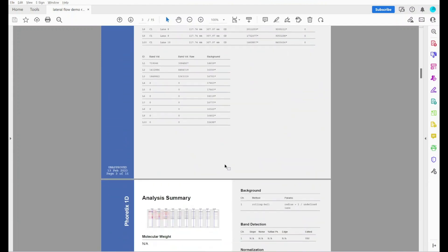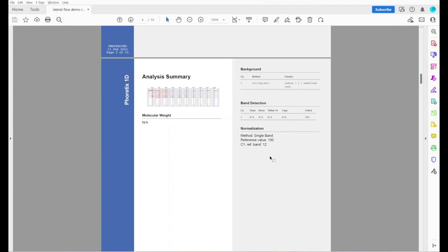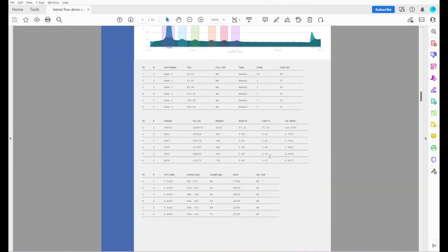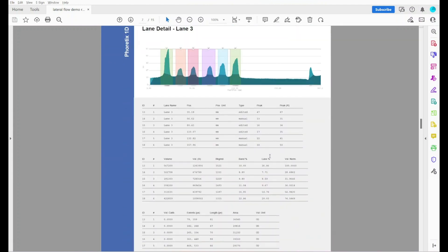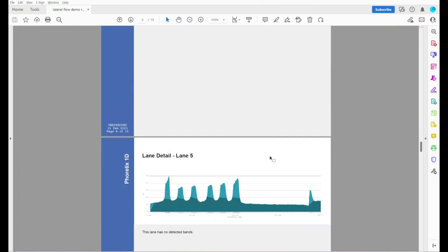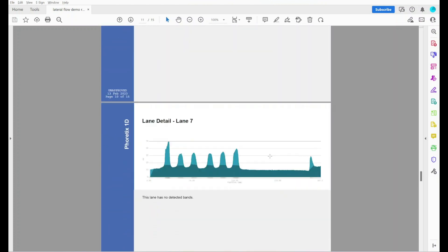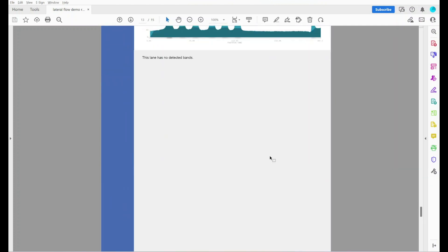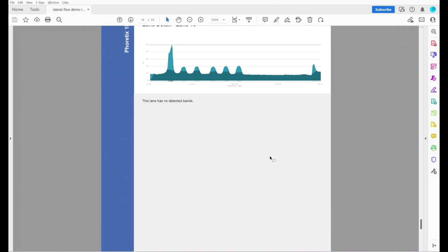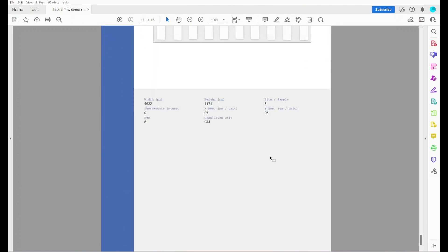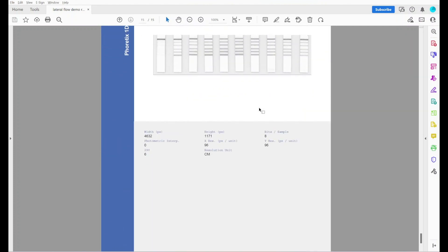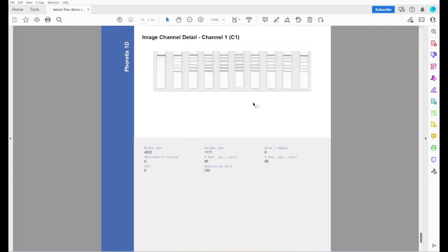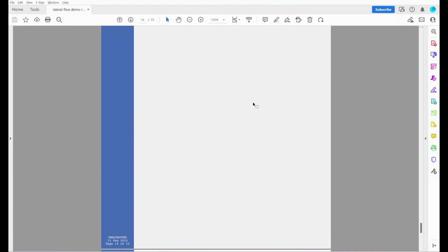We've got the image, all of the data that I chose to show, normalization methods, etc. We've got all of the band lane data. And at the bottom we've got some more information from the metadata that's held in the tiff tags for the image.